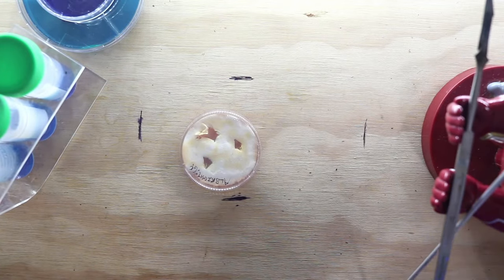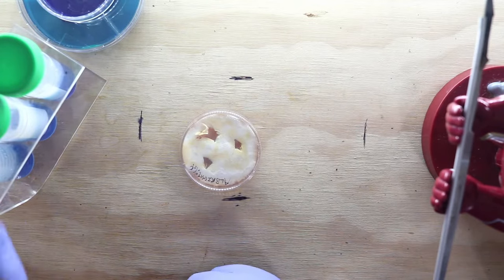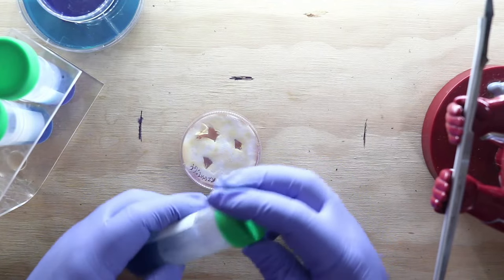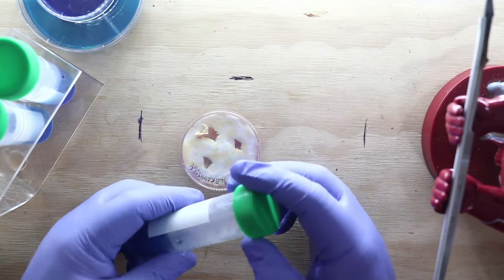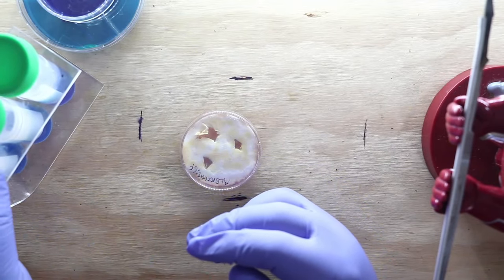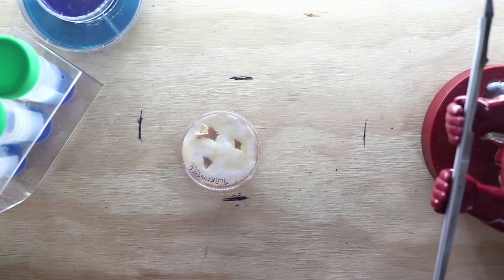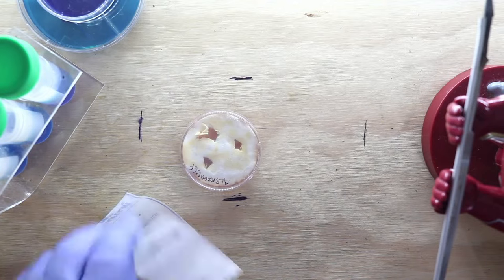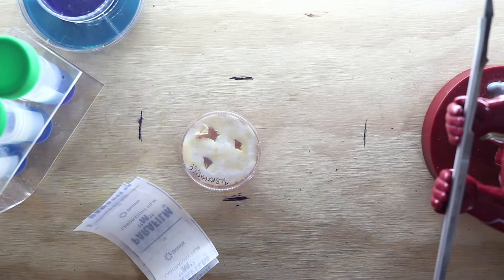All right. Now what I will do, I'm not going to do it right now because it'd bore you guys, but I can wrap a couple just to show you, is that we'll wrap the dish and the slants. Someone asked about how many slants I keep of each strain. Yeah, how many slants of each strain do you keep and how many total are you storing? Okay, so the idea, and like I said, my ideal is that I would like to sit down and make 9 slants per strain.